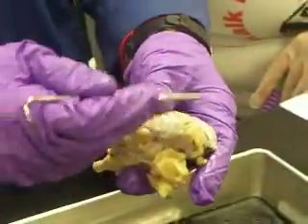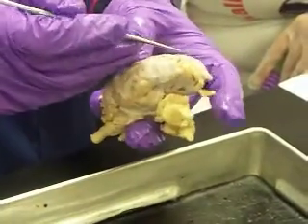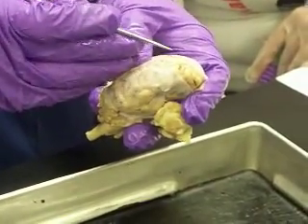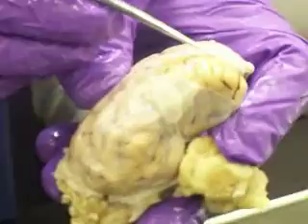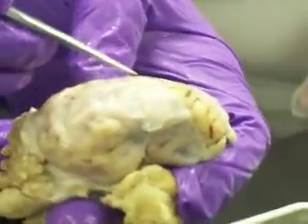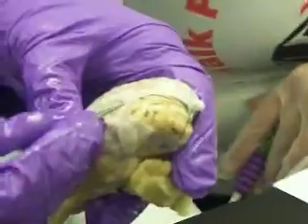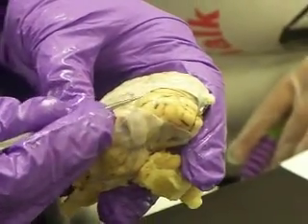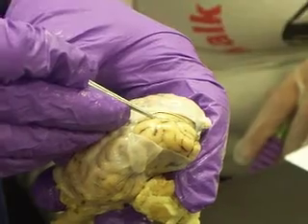Let's go back to this. We went over the general areas of the brain there, and the cerebellum, the spinal cord, but then we have these gyri. Here's a gyrus. Remember I talked about the labyrinth pattern? Kind of looks like a labyrinth there, right? Anyone ever see brain coral? It's actually quite similar to this if you're a scuba diver. So that's the gyrus, and then a sulcus is the area between those.